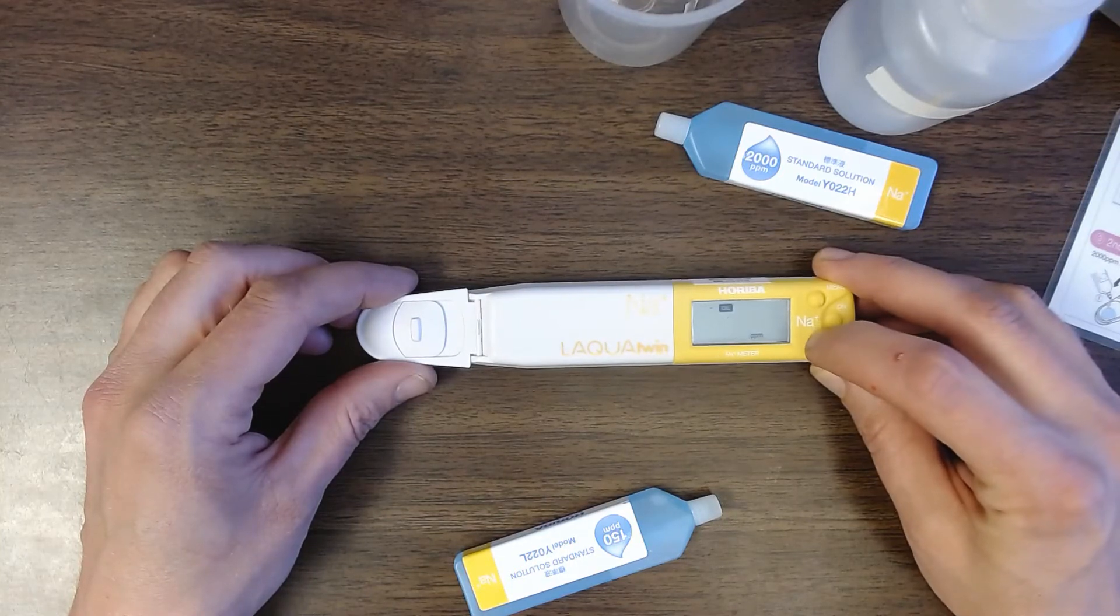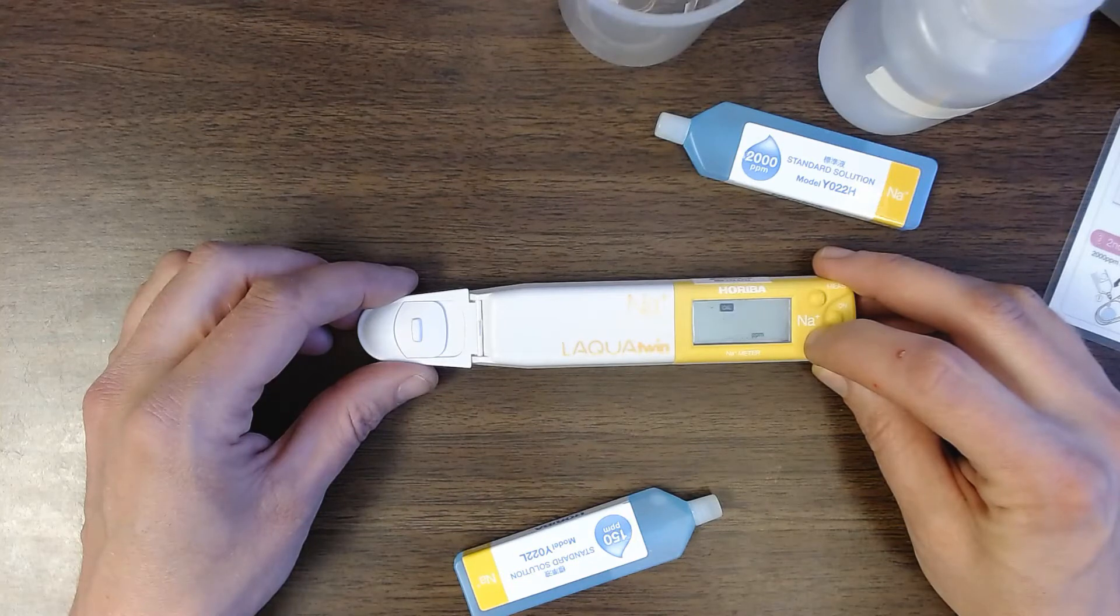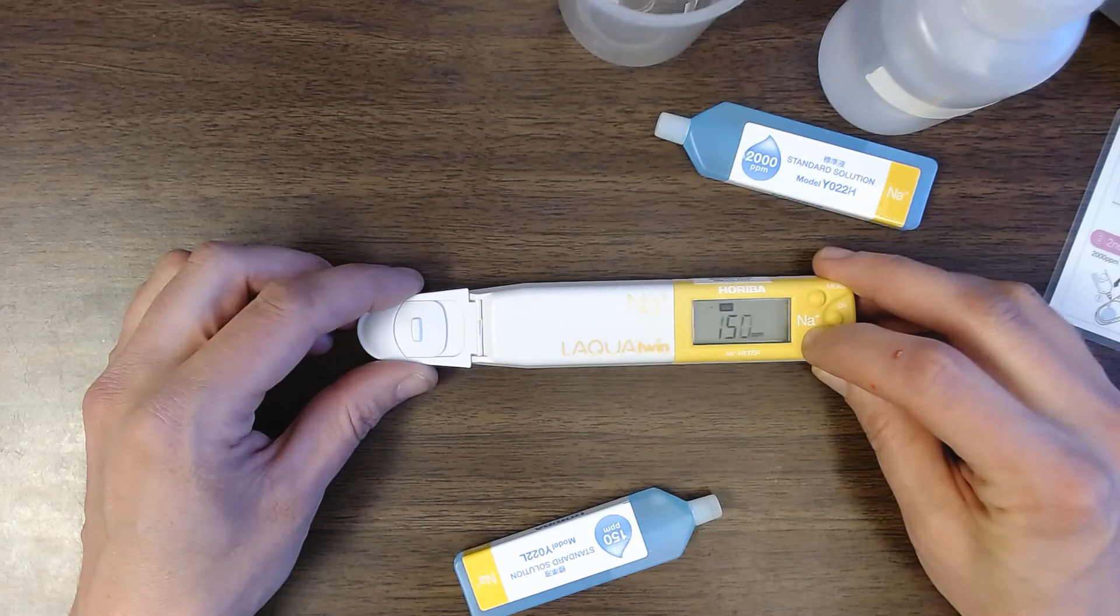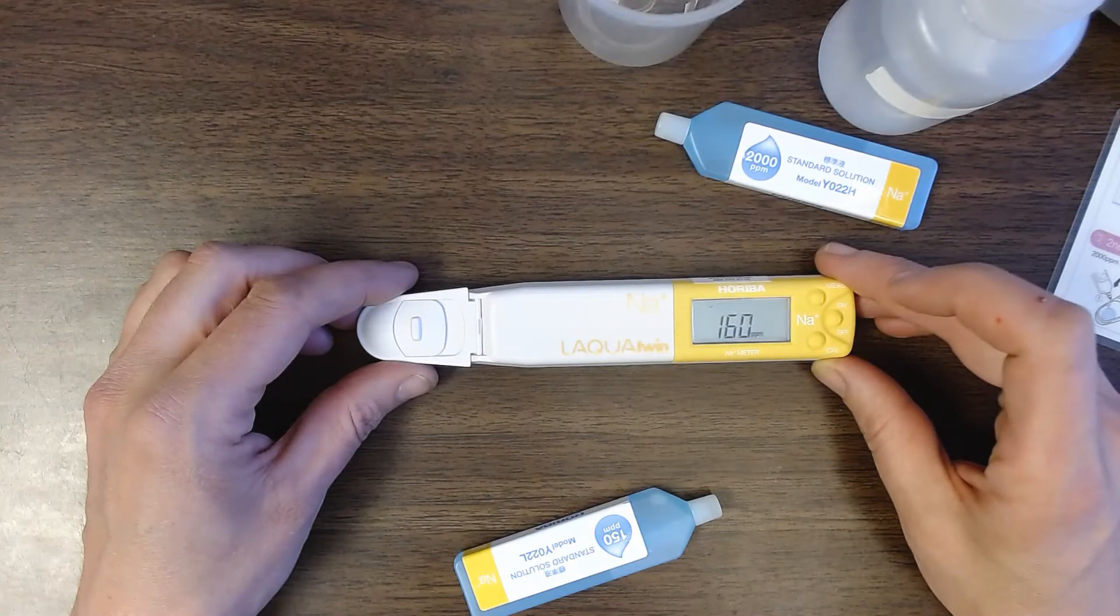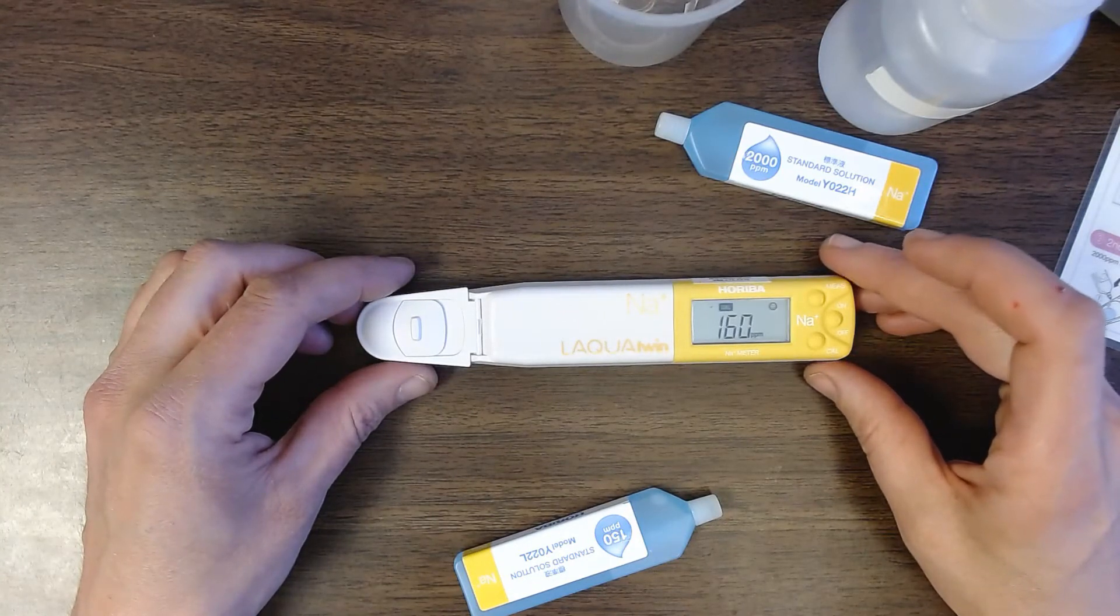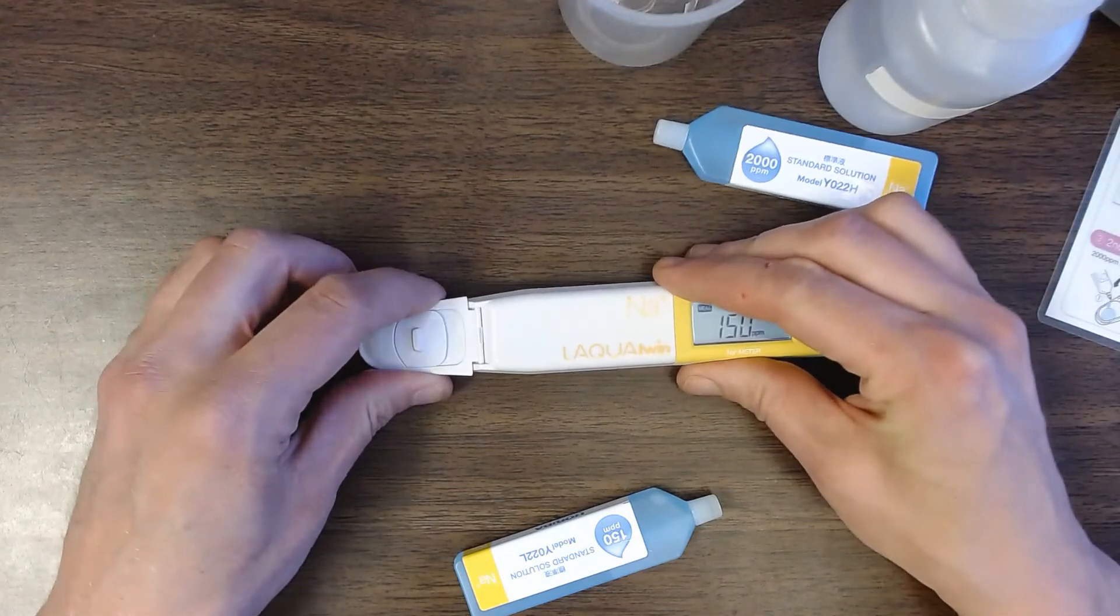So I'm going to press the cal button. And it's going to ask are you meaning to calibrate at 150 parts per million? And I am. So I'm going to press cal again. A little bit longer. And then it's going to show me a happy face to show okay now it's calibrated at 150 parts per million.